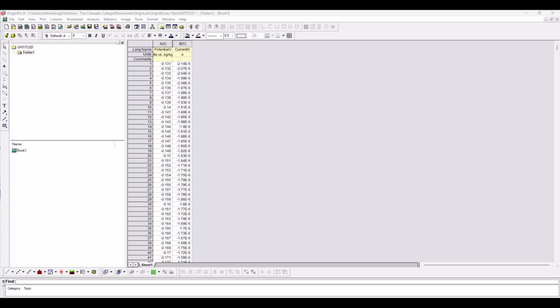So delete any headers or labels. Usually there's a whole bunch of lines at the top of your data that you don't need. So I delete all of that, clean it up, make sure I have really nice XY data. And then I just copy it from Excel and paste it directly into these two columns, which are here for default.